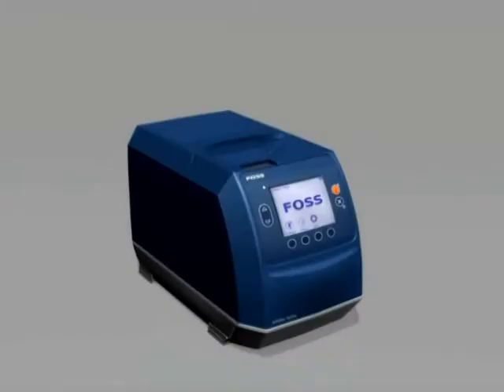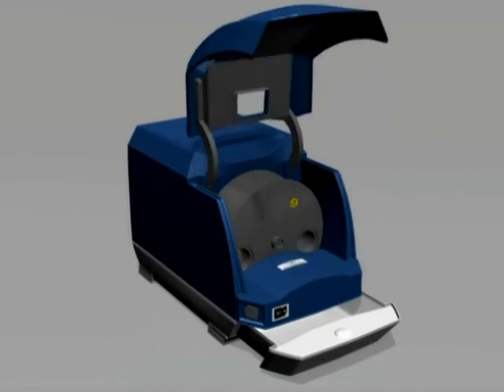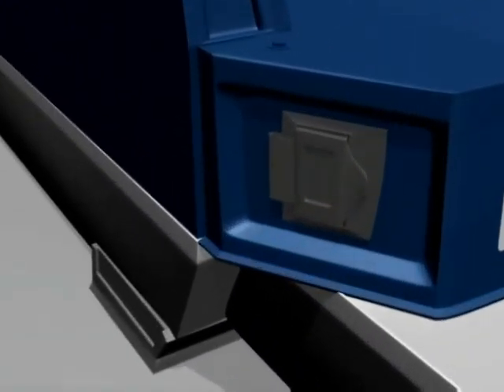Before the blue instrument hood can be lifted, the drawer must be opened as the drawer locks the hood in place. Once the drawer is pulled out, pull up on the bottom edge of the hood. When the hood is opened, the SD card slot and the sample wheel are visible.